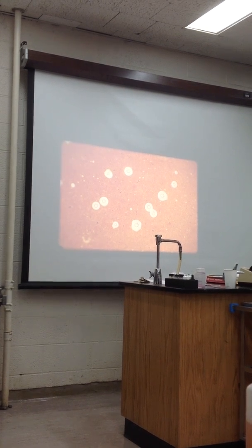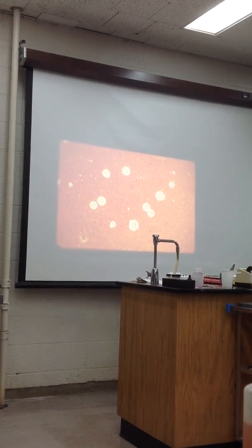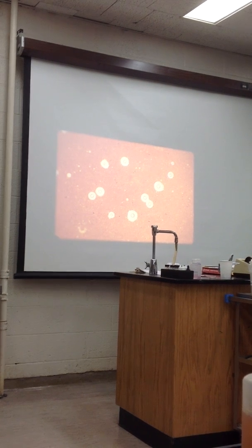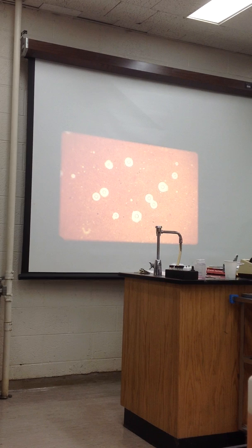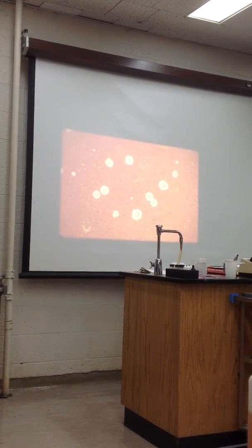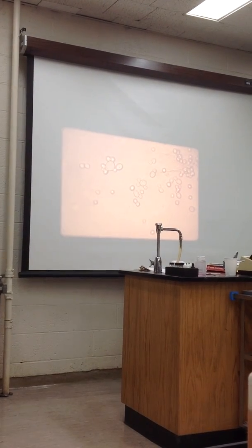Cryptococcus neoformans. Now just draw one on the board. In other words, you have the big capsule surrounding the organism. Cryptococcus neoformans. Meningitis. That's basically a budding yeast body.